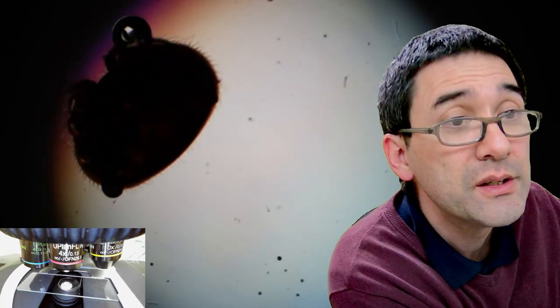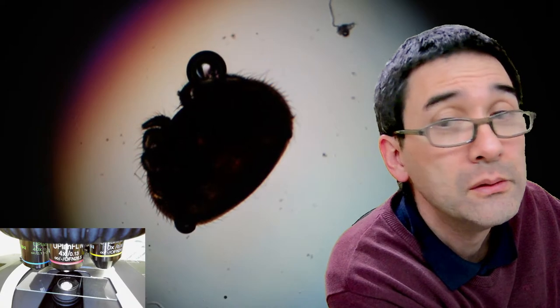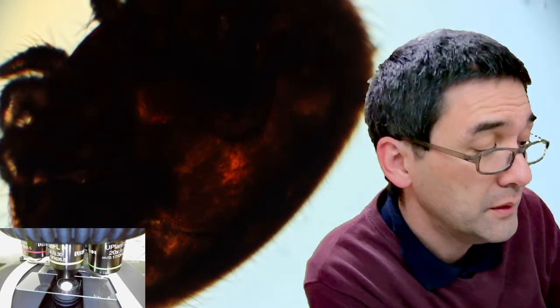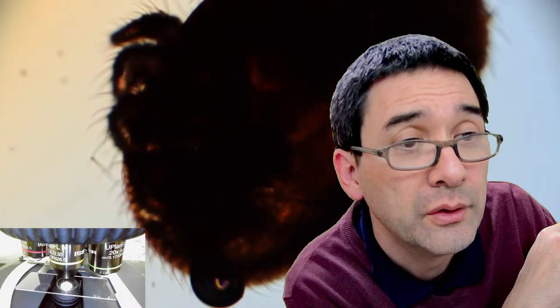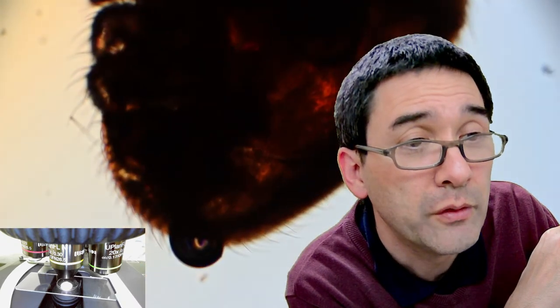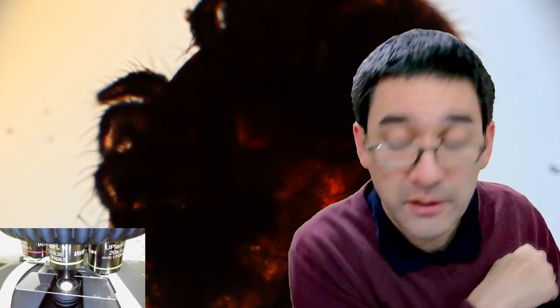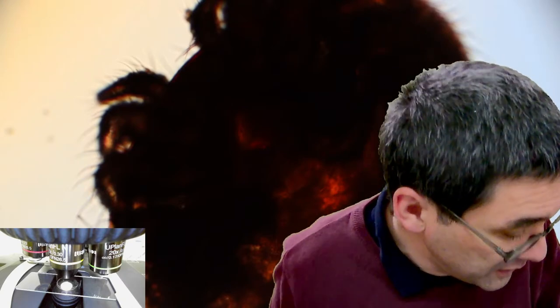Where is it? Here it is. Yeah, bubble. Okay. Yeah, so that's how it looks like. Pretty much very similar to the others. Okay, a bubble over here. Yeah, there seems to be another bubble down here as well. But we're gonna see, okay? So, I'm going to leave it here, and I'm going to now mount the other one.